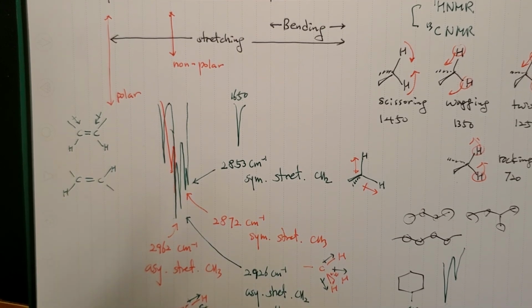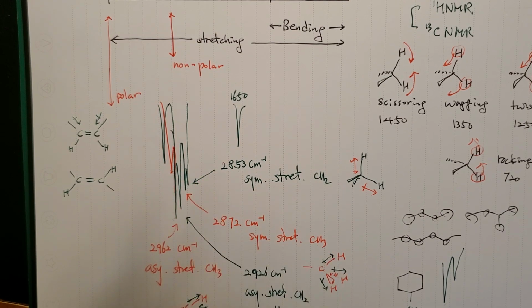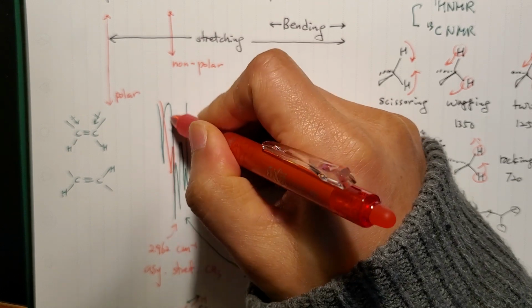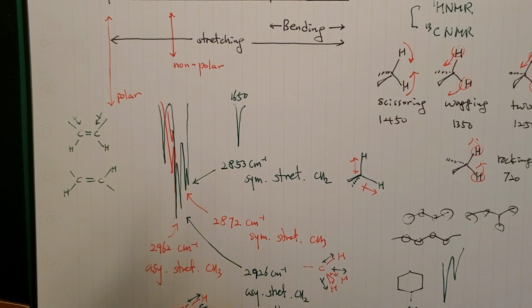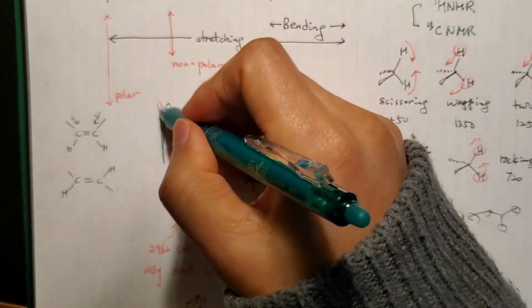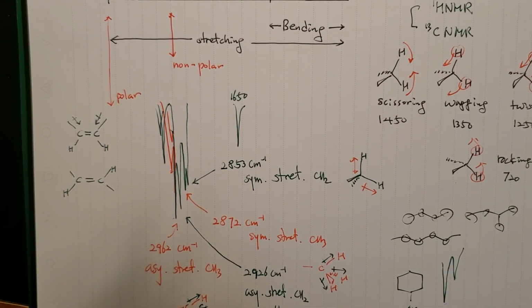But when you have the trans isomer, when the molecule's reduced mass is somewhat bigger, then the frequency decreases a bit. So when that happened to be a shoulder of this sp3, it could be somewhat smaller. Or when it's a small peak of the double bond, then it could be an isolated peak, but compared to the cis isomer, the trans isomer's intensity can be smaller.